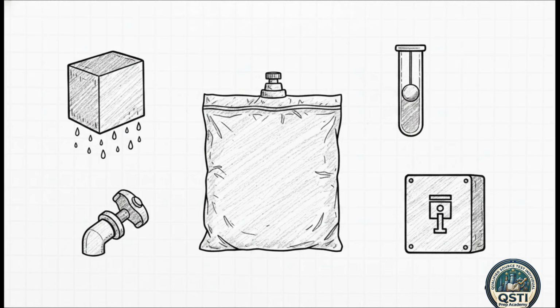You'll measure that flow with a rotameter capable of reading 0 to 1.0 liters per minute. But the absolute star of the show? The Tedlar flexible bag. The method calls for a massive capacity of 60 to 90 liters. It's basically a giant, heavy-duty scientific balloon. And you can't just trust it out of the box. You have to leak test this bag in the lab before you ever step foot on site, evacuating it completely and making sure that meter reads absolute zero flow.